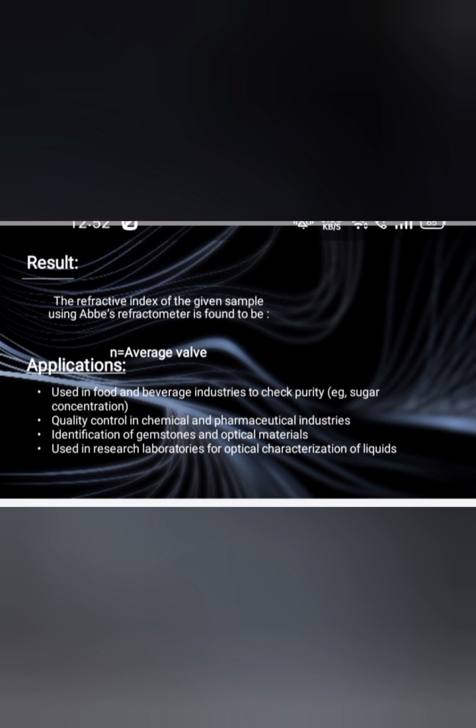average value. Applications. Used in food and beverage industry to check purity, for example sugar concentration. Quality control in chemical and pharmaceutical industries. Identification of gemstones and optical materials. Used in research laboratories for optical characterization of liquids.